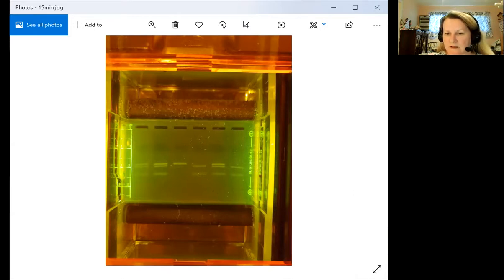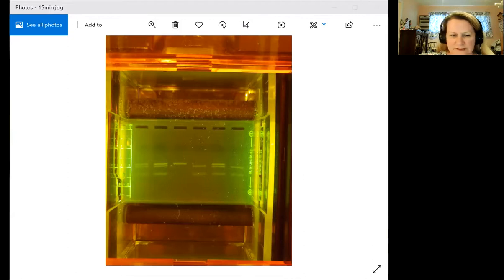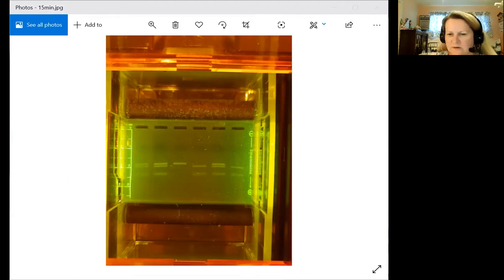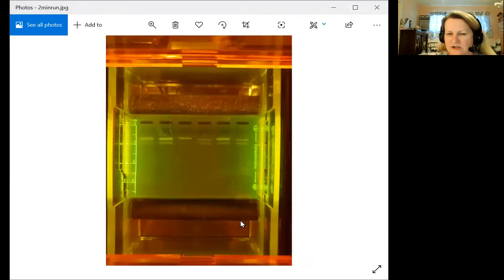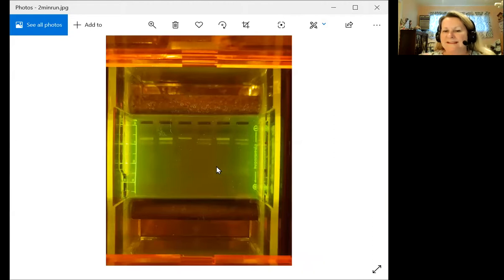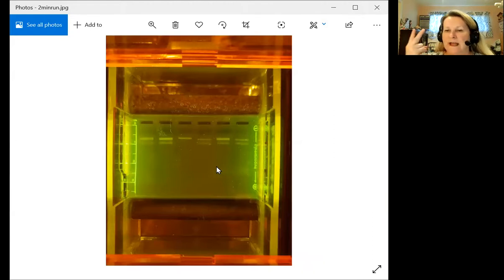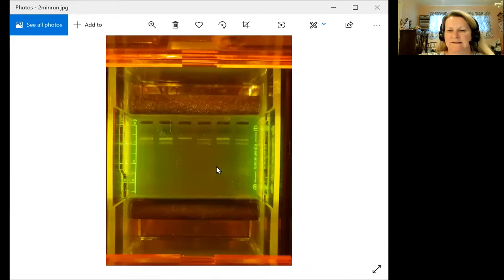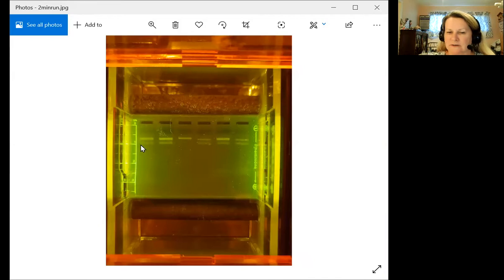I want to show you one more picture. I took a picture after the gel. This is just after two and a half minutes. After two and a half minutes after I started the gel, the bands had already run that far down the gel. Remember these are the shadow bands down here, but you can see how quickly that gel runs.